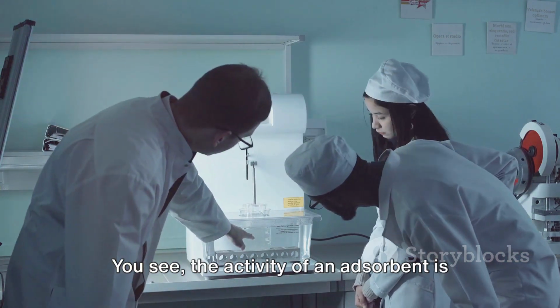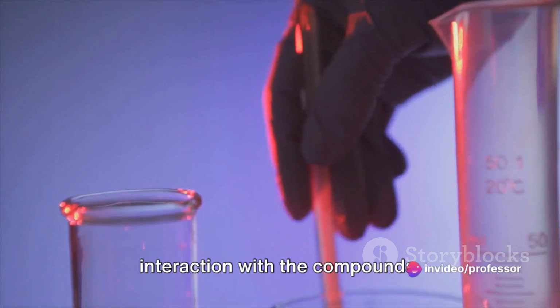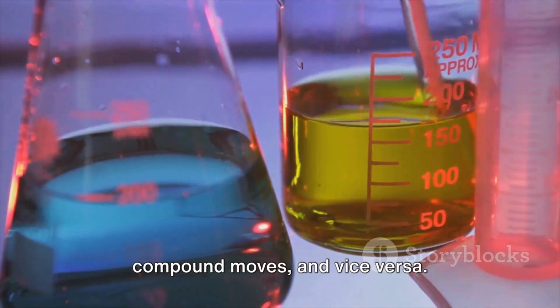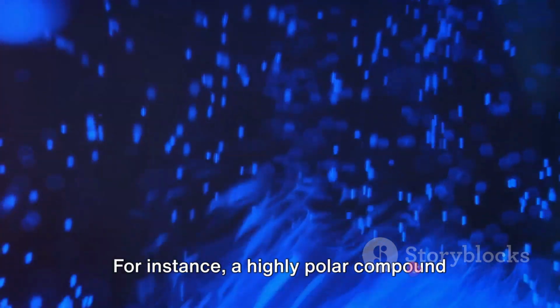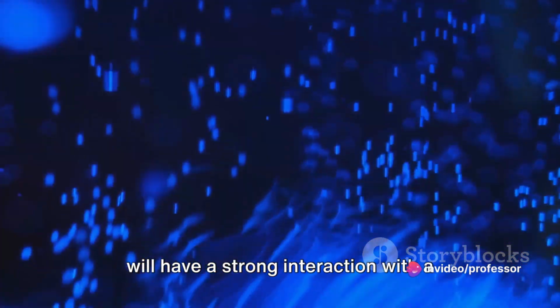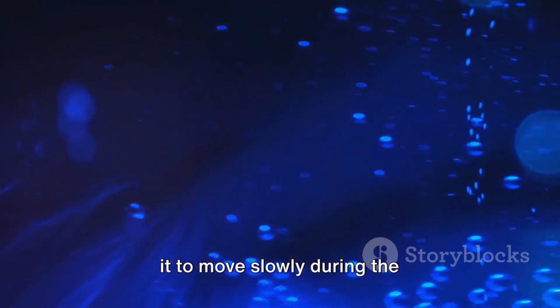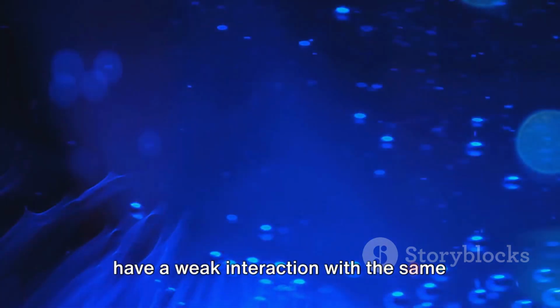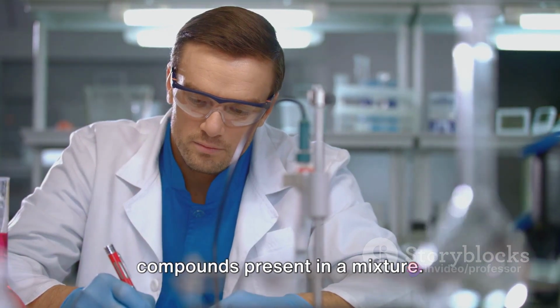You see, the activity of an adsorbent is influenced by its polarity, particle size, and pore size, which all contribute to its interaction with the compounds. The stronger the interaction between the adsorbent and the compound, the slower the compound moves, and vice versa. This is what allows for the separation of compounds in TLC. For instance, a highly polar compound will have a strong interaction with a polar adsorbent like silica gel, causing it to move slowly during the chromatography process. Conversely, a non-polar compound will have a weak interaction with the same adsorbent, causing it to move faster. This difference in movement is what allows us to separate and identify the compounds present in a mixture.